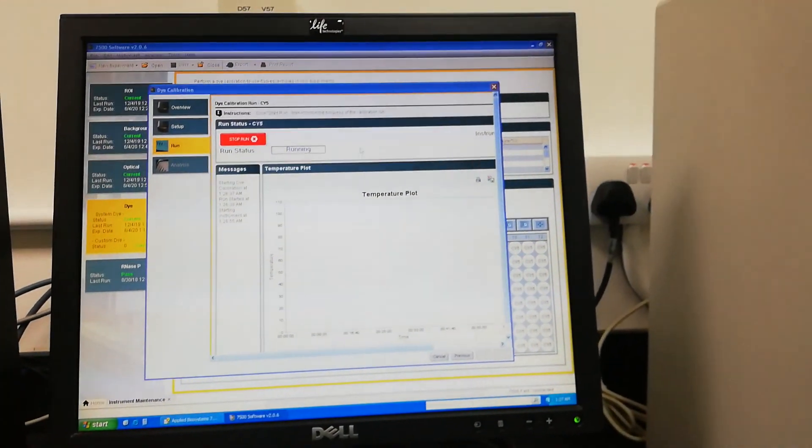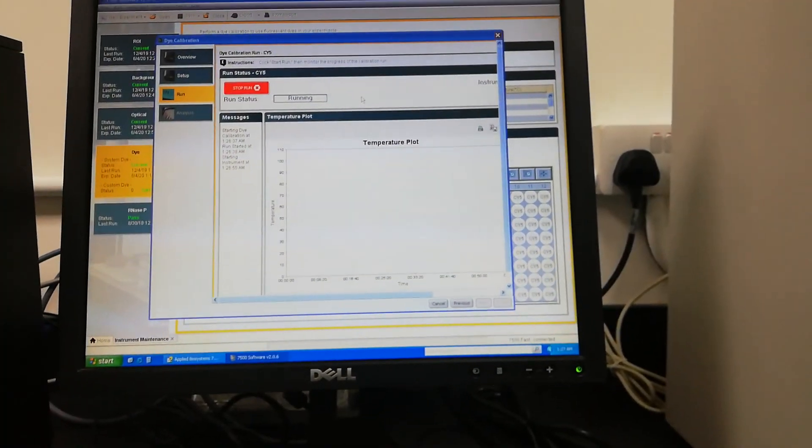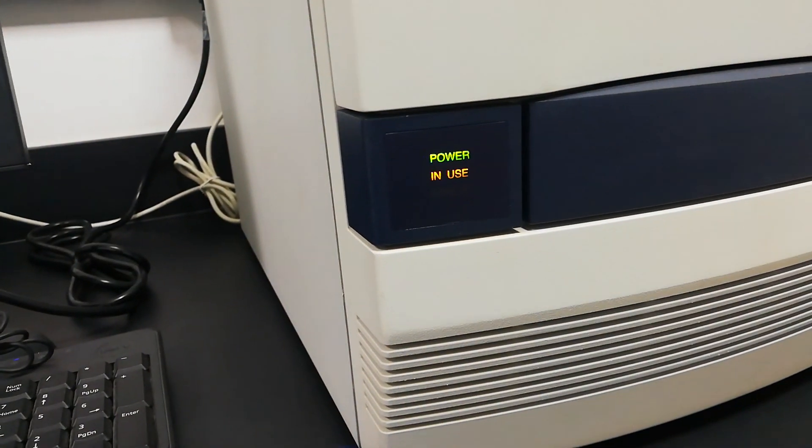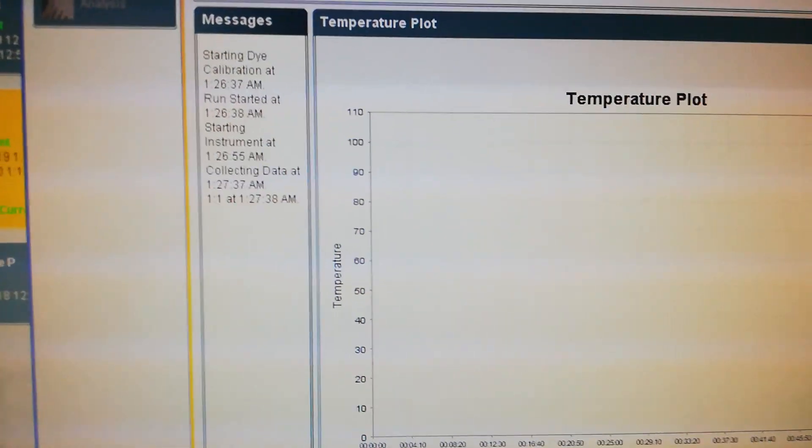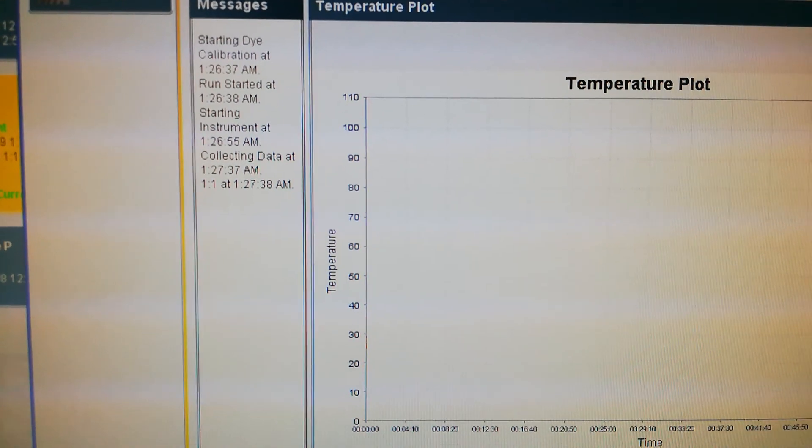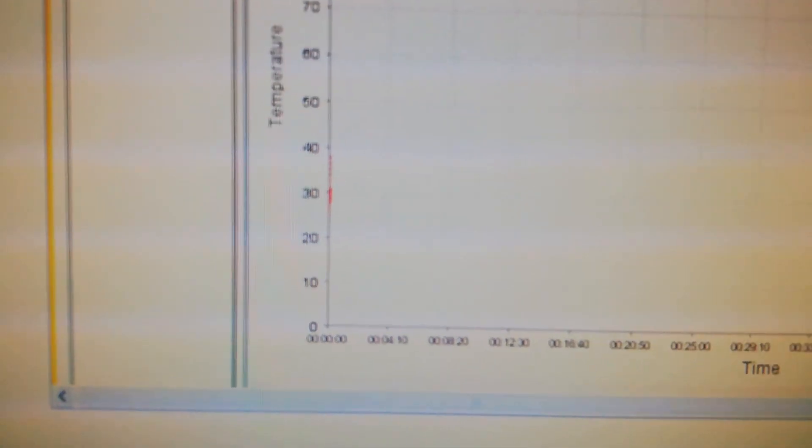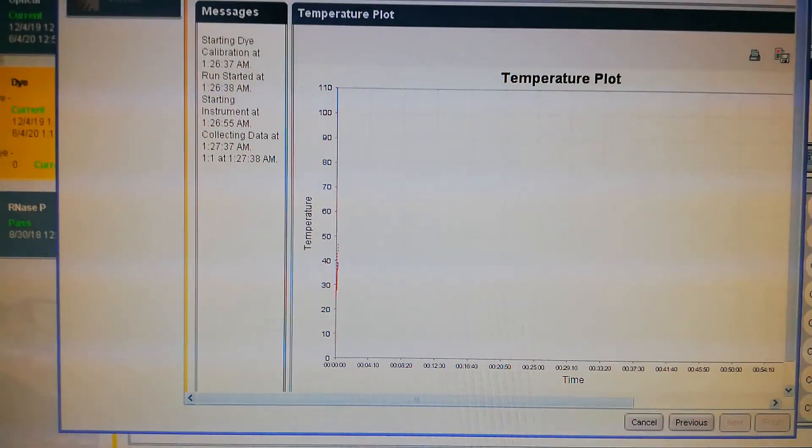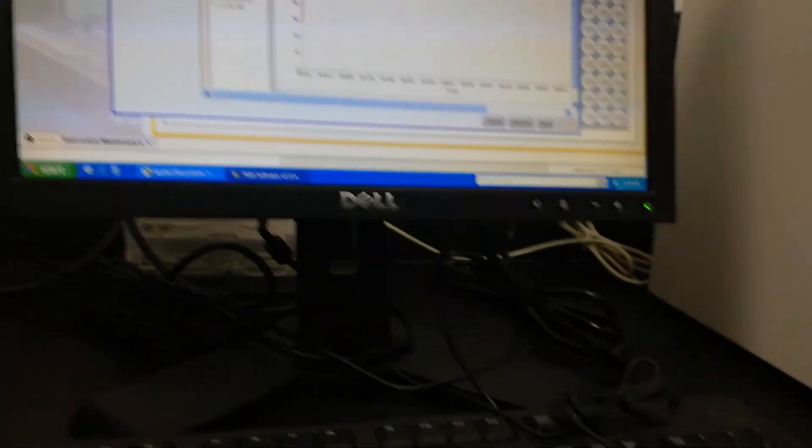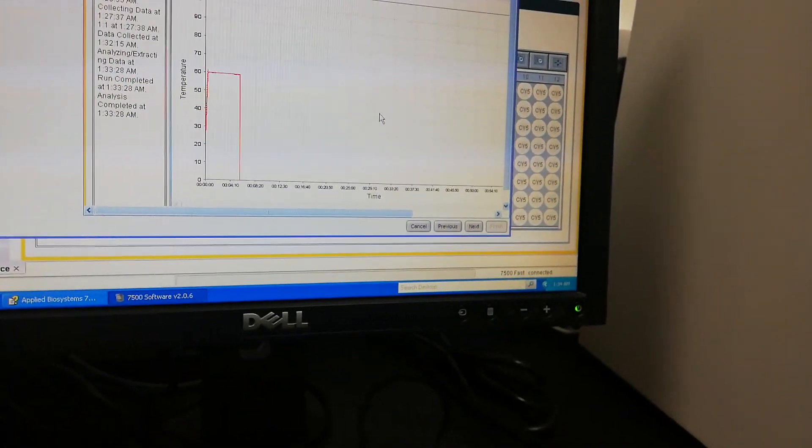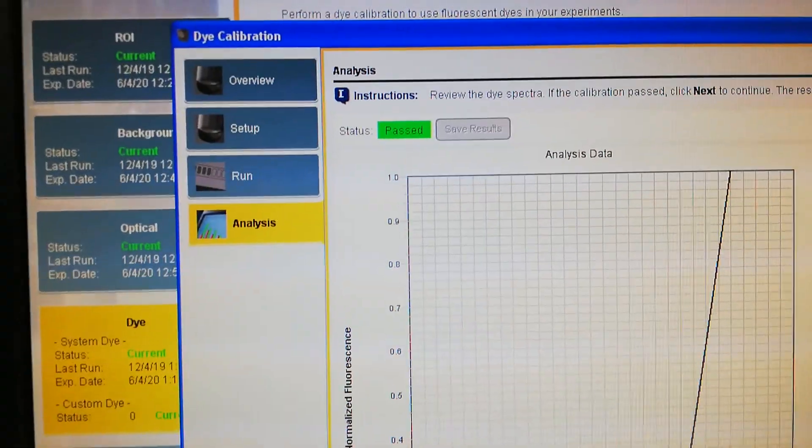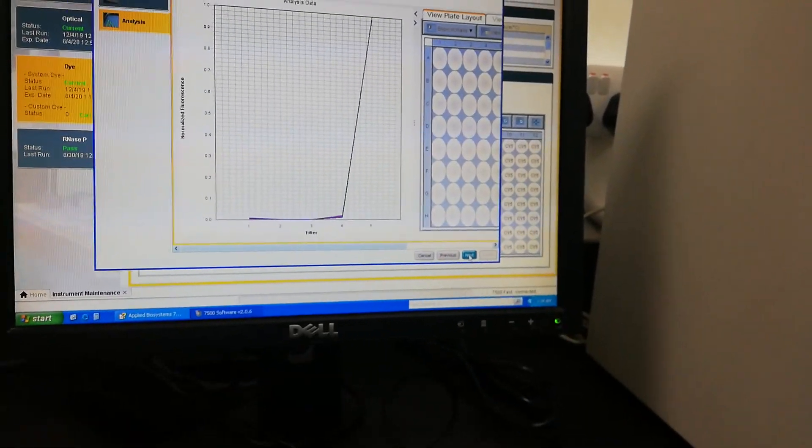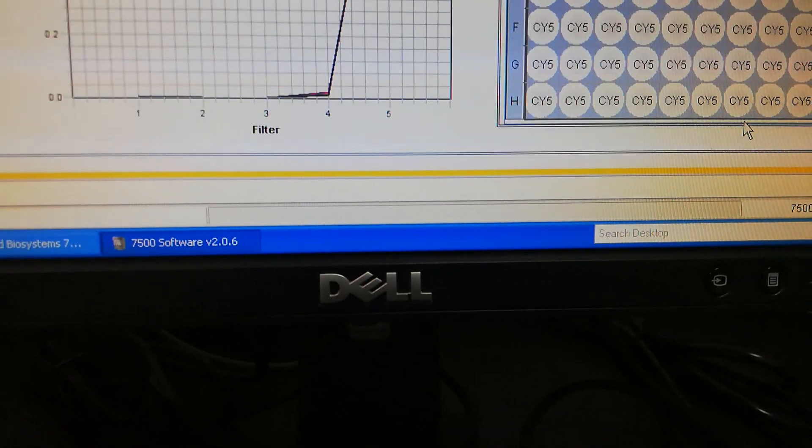It will just update the data and collecting data, you can see the data collection has started. This is also done, CY5. Next, passed. Next and finish with CY5.